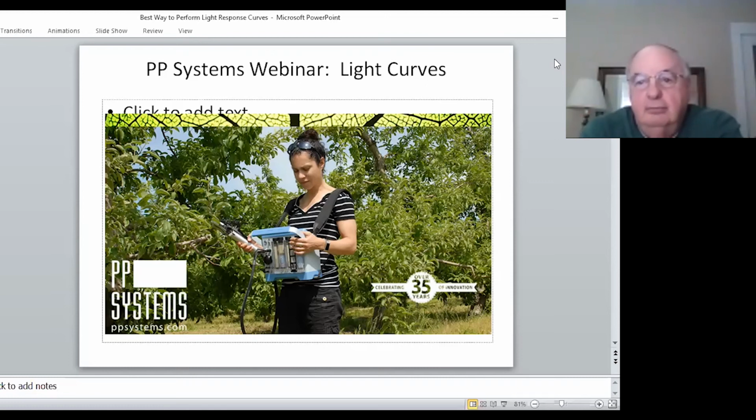We do have some questions. Assuming you do want to know the compensation points, how would you recommend maintaining a set CI?